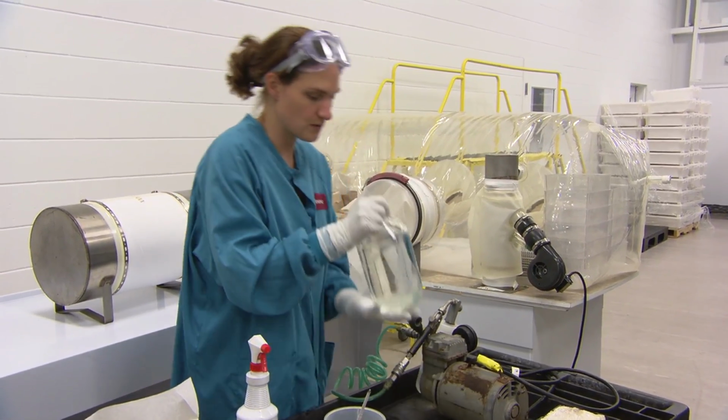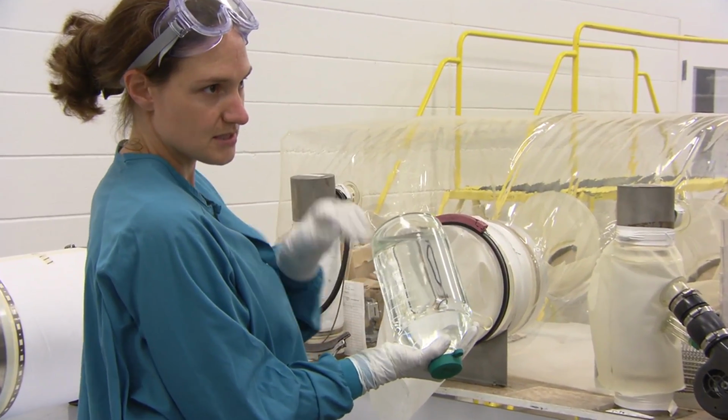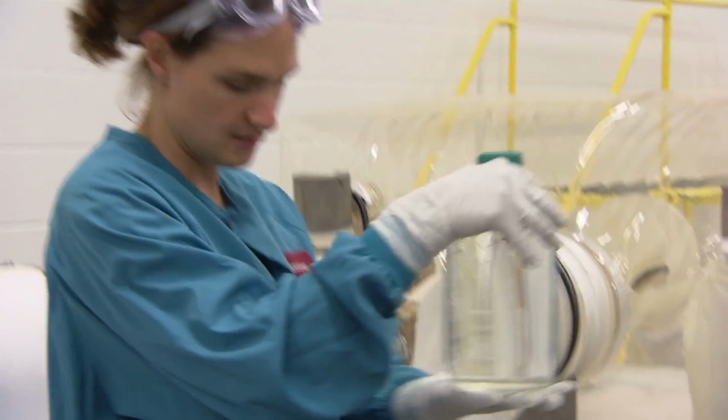And another thing that you can do is you can kind of tilt your bottle sideways. And as long as you don't see any air bubbles continuously moving up the bottle, you know that there aren't any pinholes anywhere. So this one is good to go.